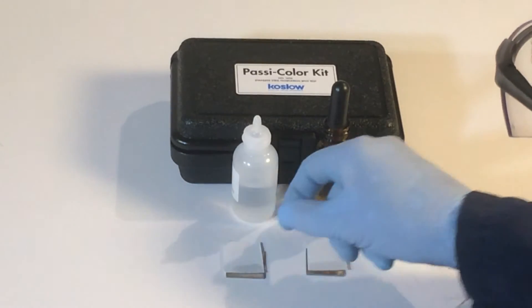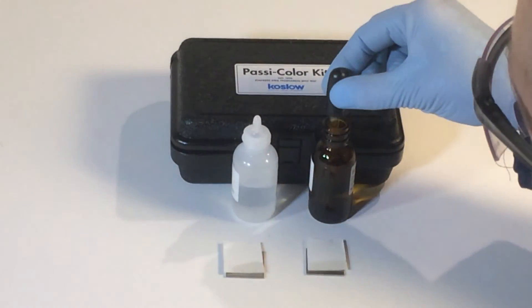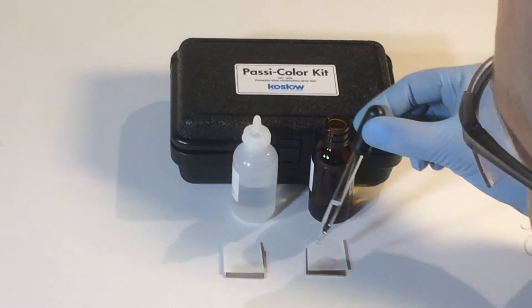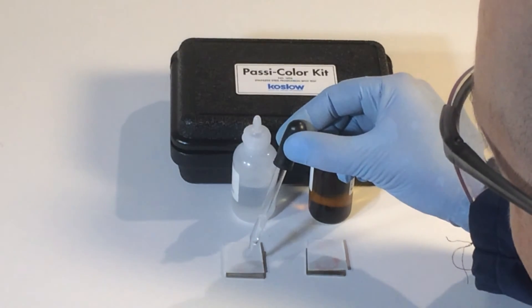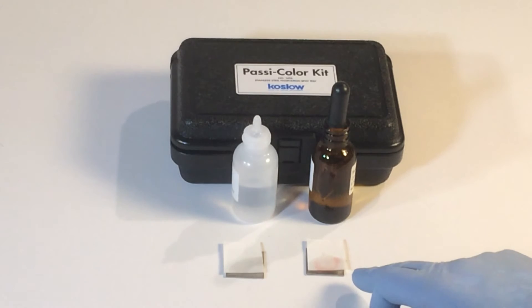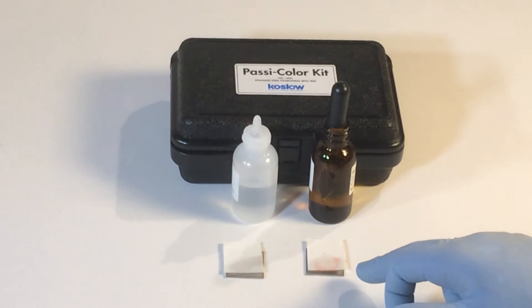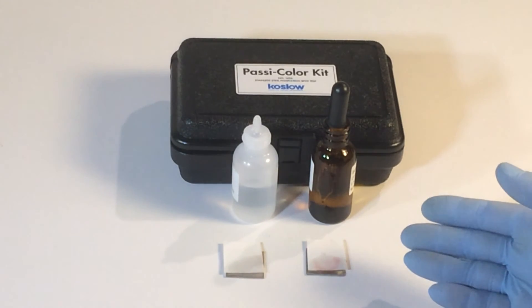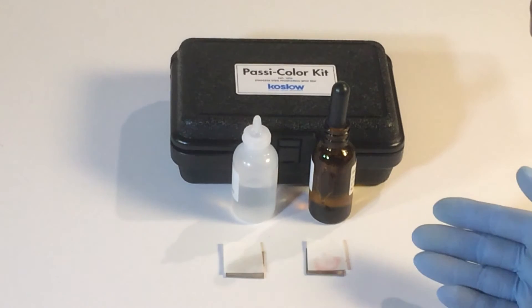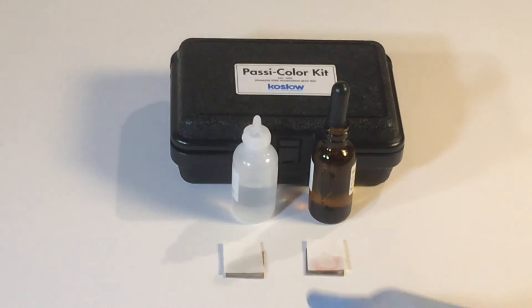Let's find out which of these stainless steel parts is passive and which one is not. It looks like this one is not passive — perhaps the sample was abraded, or something during the machining process embedded free iron into the surface. This one looks like it's definitely passive stainless steel.